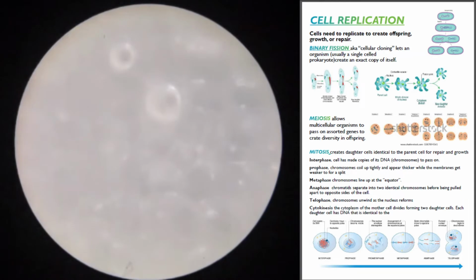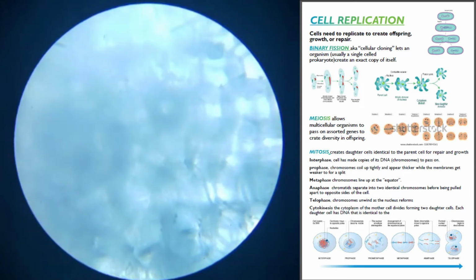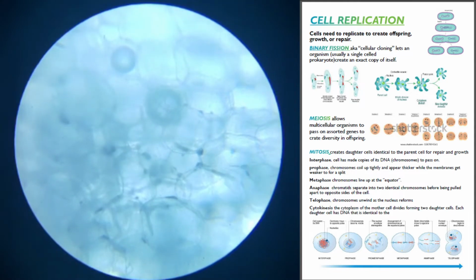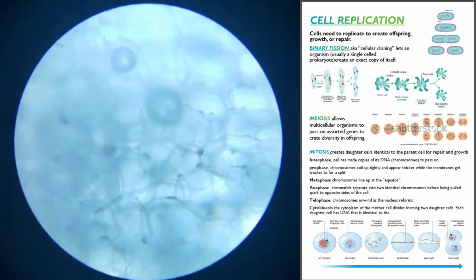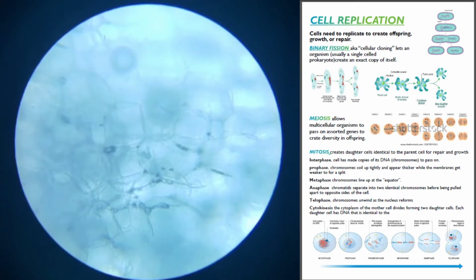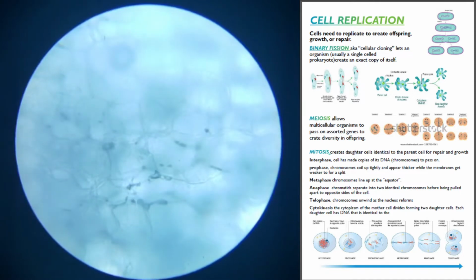You can see a couple bubbles there. See the bubbles. Turn that light back on. Sweet. Seeing a lot of cells with no nuclei though. I can see some fragments of things in between. So it looks like we have a lot of pieces of onion that are not at the root.